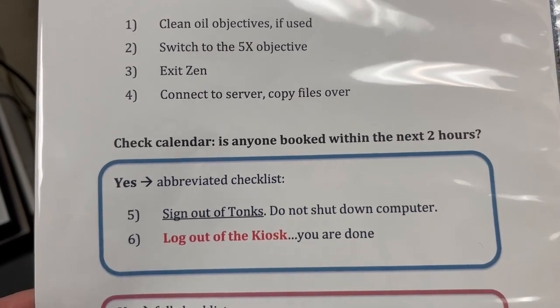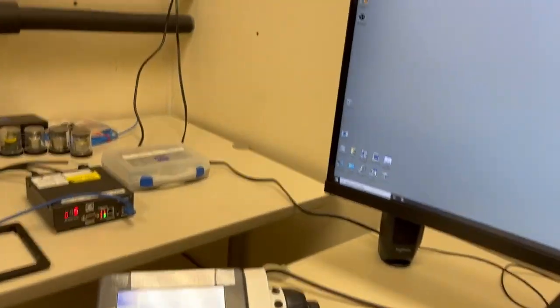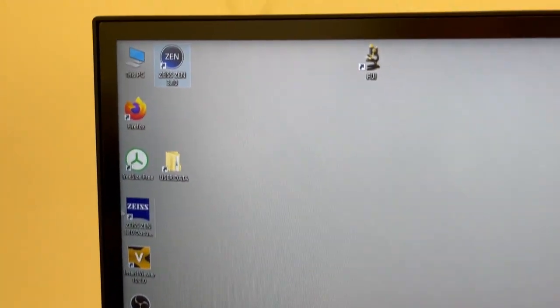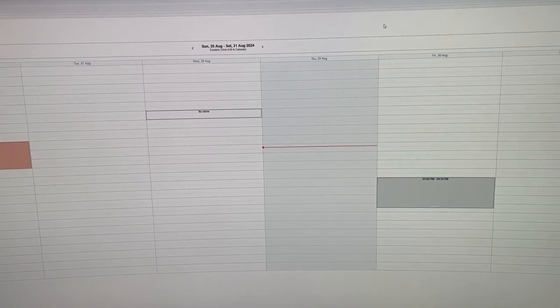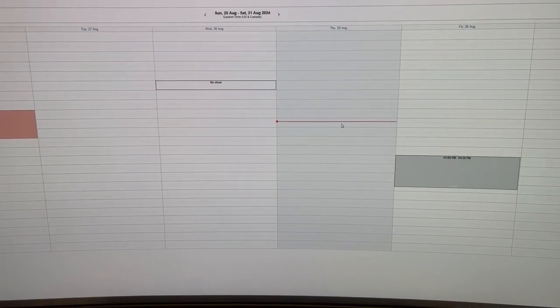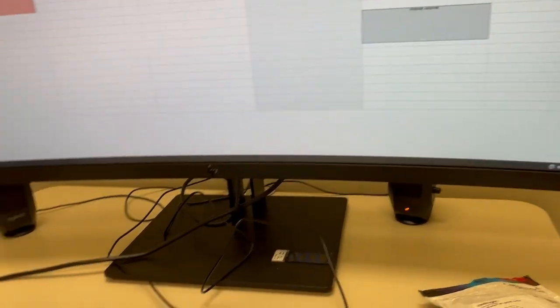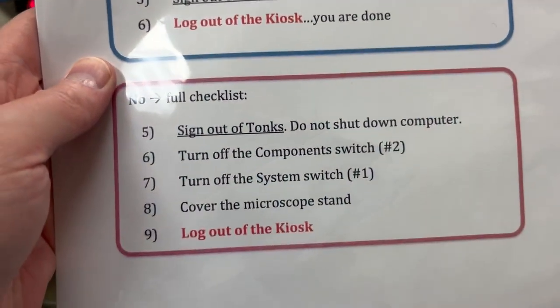The next step is to check the calendar to see whether anyone is booked within the next two hours. We have made a link here to Firefox — if you double click on this, you will see that it defaults to the calendar. As you can see, in this case there's no one within the next two hours, so the answer to the question 'is anyone booked within the next two hours' is no.